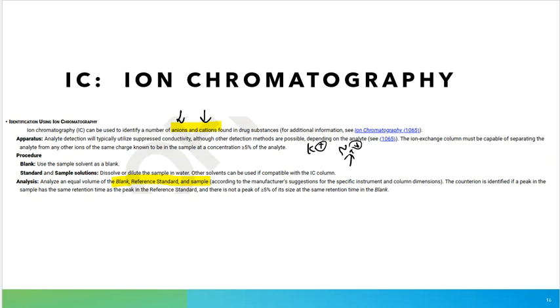And is the machine able to really separate this positive one, sodium, from something that carries a similar charge, which maybe would be potassium, that also carries positive one, right? That's what this is all about. So that's why it says this is proper as long as you can separate that positive one piece from all the other things that are present, because you want to measure the amount of sodium, not everything else in the sample. Maybe we're just focused on this one thing. That's a possibility, right?